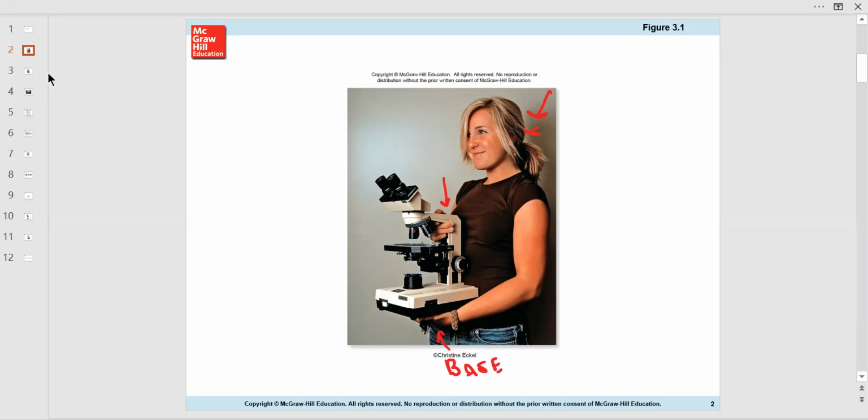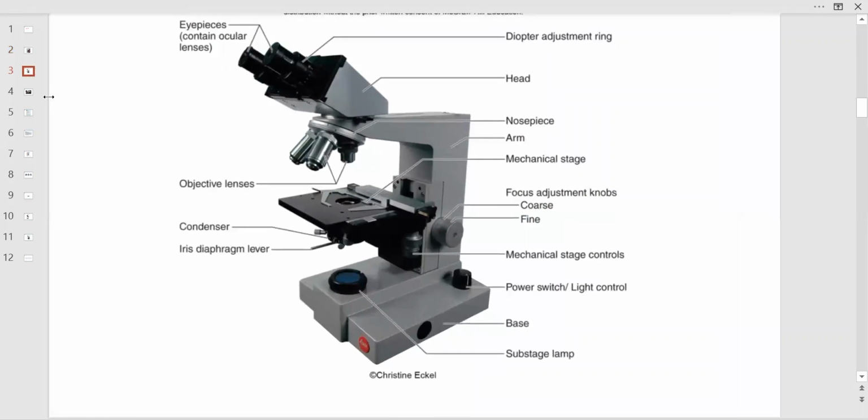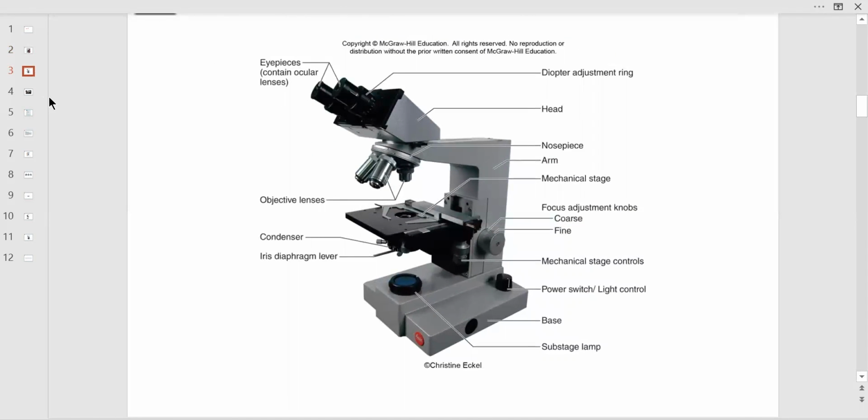Because on this next exam, as ridiculous as it may seem, you'll get a picture of this microscope and you've got to tell me what the parts are. And that's probably going to be fill in. So you might as well do it today or this week in your virtual lab. So you have the arm on top where she's holding, and then you have the base. Basically that's the main thing, right? And then you have all the little parts in between. I'll make this a little bigger for an old guy like me. I think they call it the Brightfield microscope in McGraw-Hill. So hopefully this is the same one.